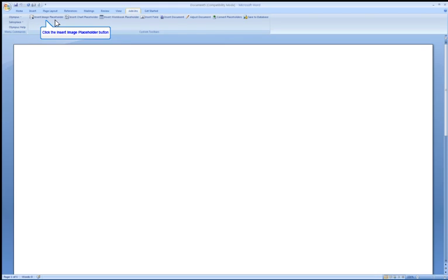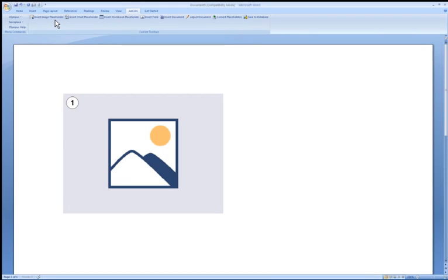Let's insert an image placeholder. You can also insert fields into the document that will autofill when you generate a new report. Select the Insert Field button.